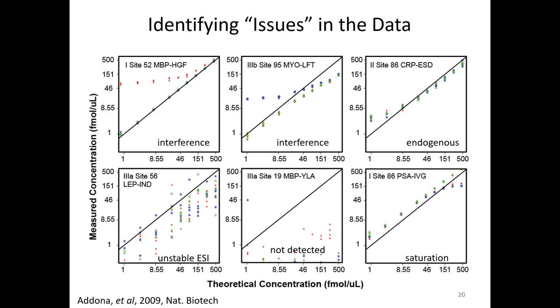There's a fair amount that's present in the sample. You weren't expecting something that didn't already exist in the matrix. Exactly. Sometimes it's really hard to find your sample matrix that doesn't have your compound in it. In the case of CRP, it's pretty detectable in plasma even at low abundances. And so when you see all three of the transitions agree with one another, but not adhere to the line, particularly at the low end, that's indicating you're picking up endogenous levels of that protein in the sample.